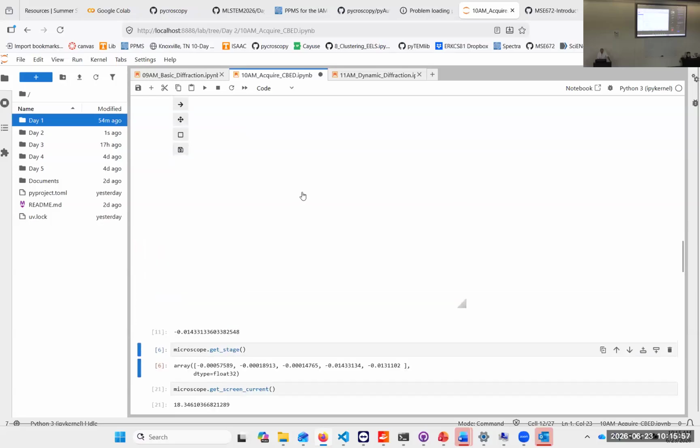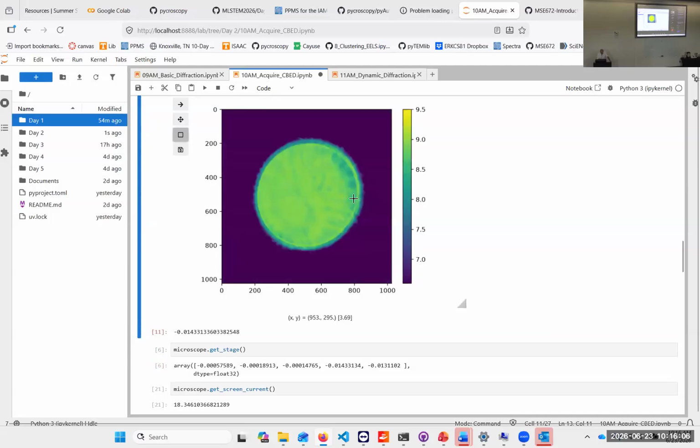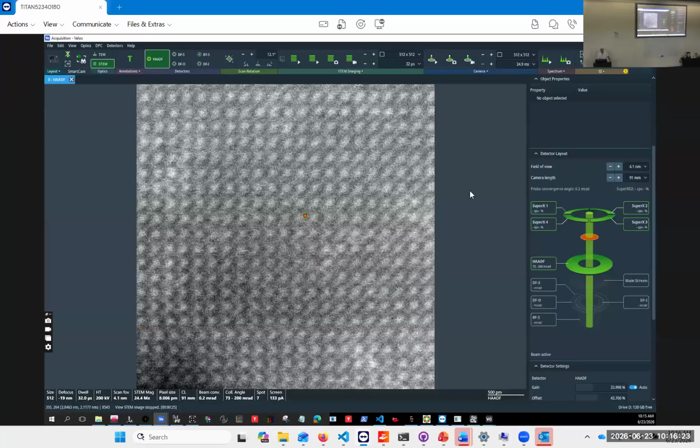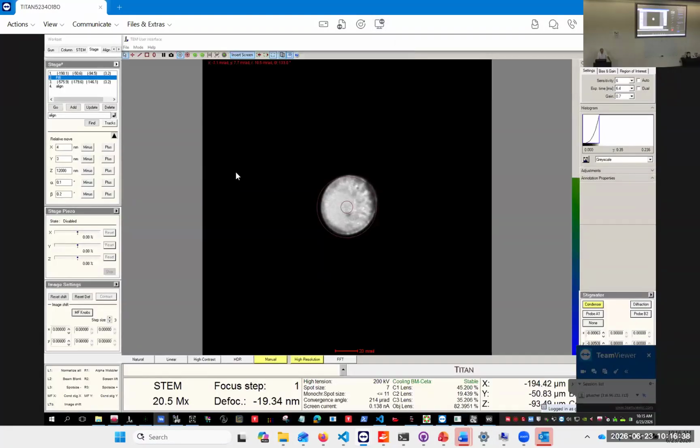So let's get an image diffraction pattern here. Here it is. It's a bit bright, and I guess we drilled a hole by now. It's interactive. Yeah. So we have a hole in our sample. Let's move it around a little bit. Let's check it out on the main screen. Okay, so we see very nicely the hole we drilled.